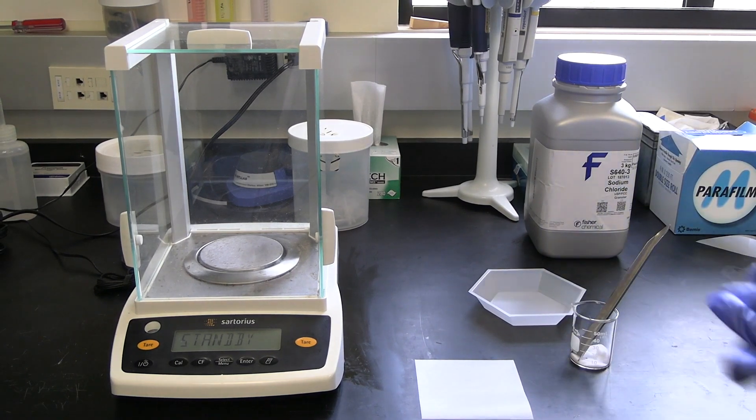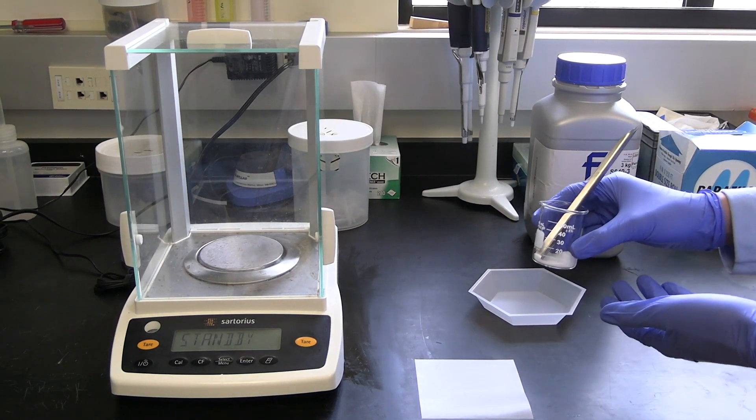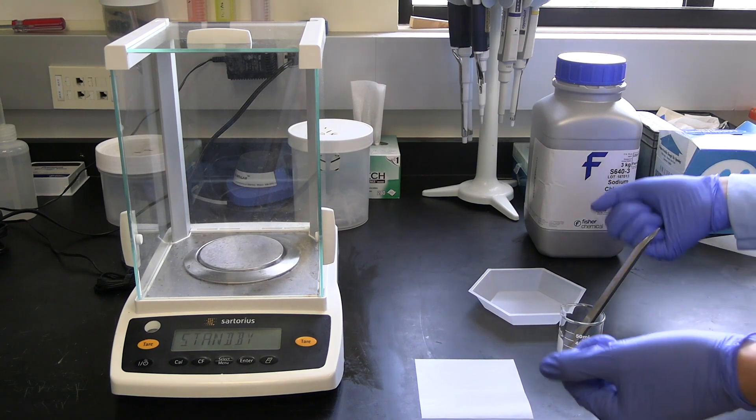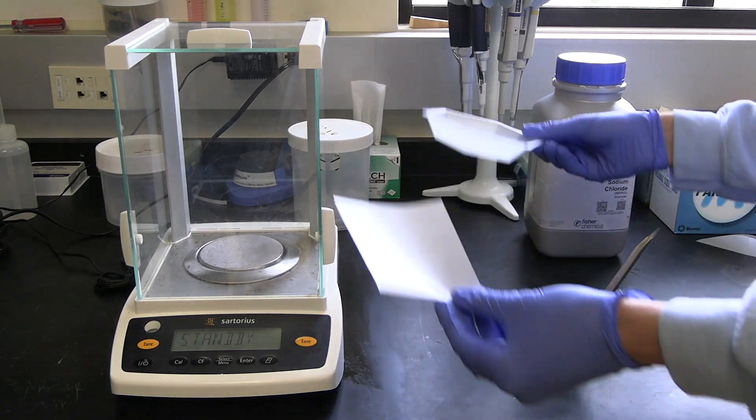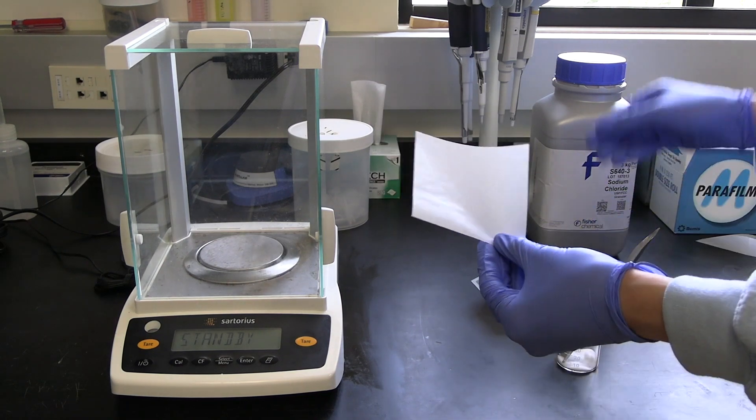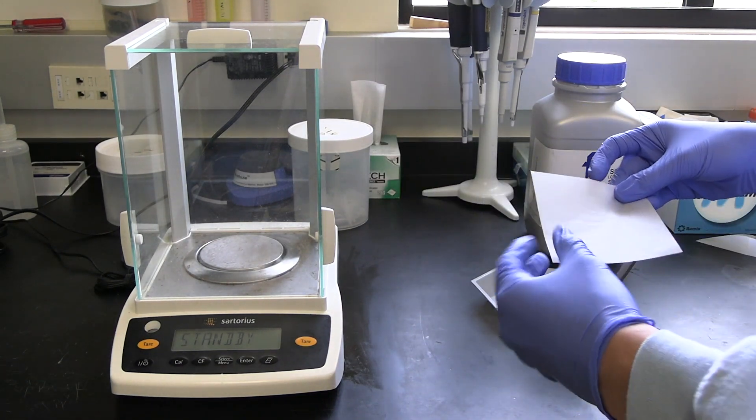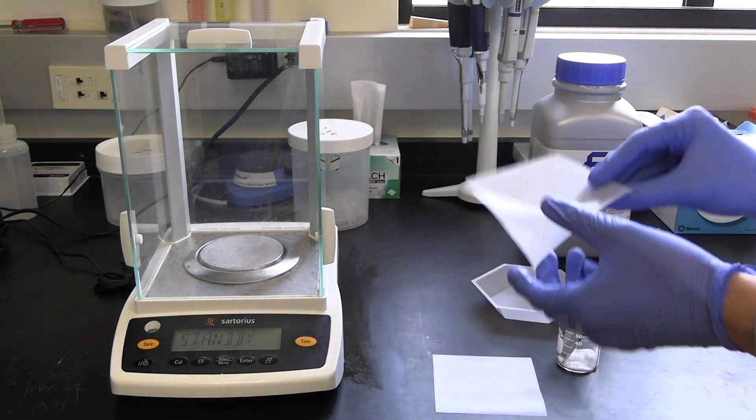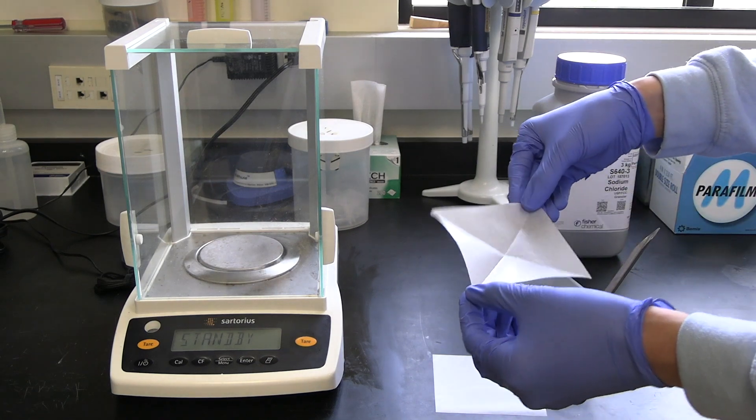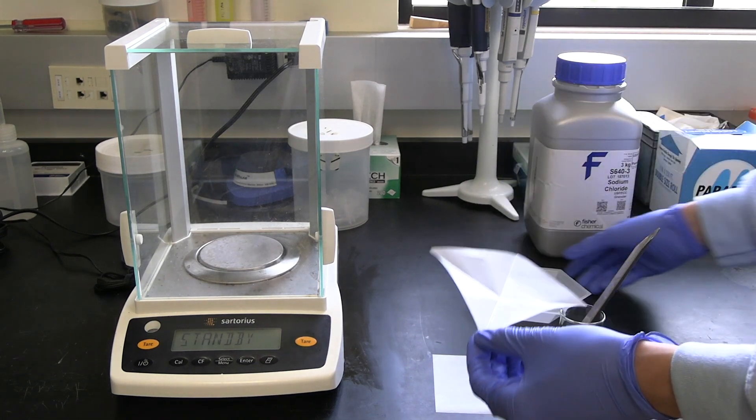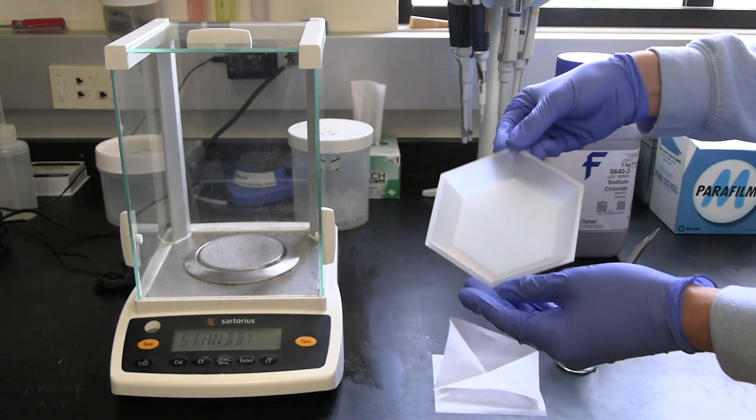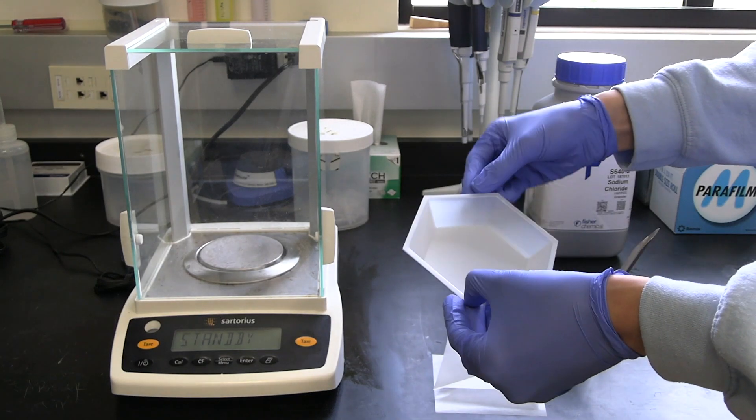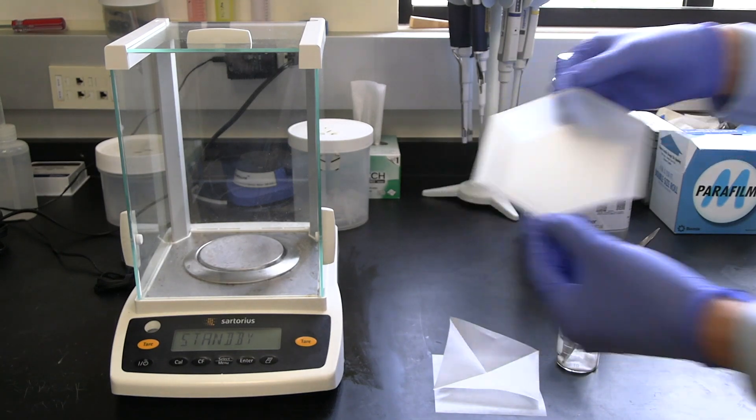And now, to actually weigh the sodium chloride substance, we can use two different types of weighing material. We can use a weigh paper and crease it along both diagonals to create some sort of weigh boat. Or, we can use an actual weigh boat, which has sides to prevent the material from falling out.